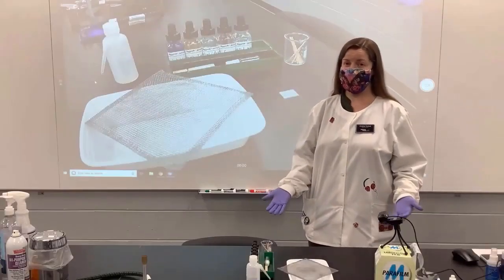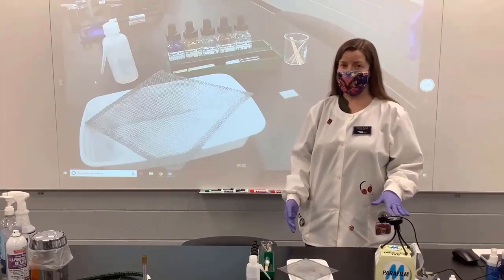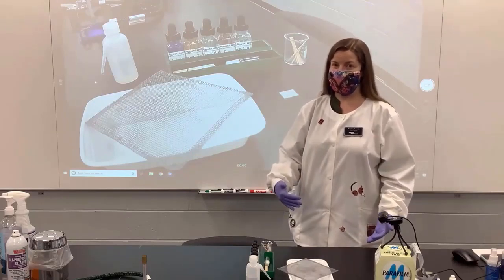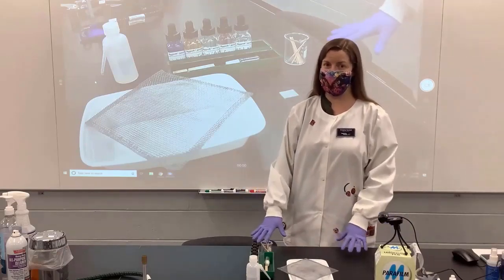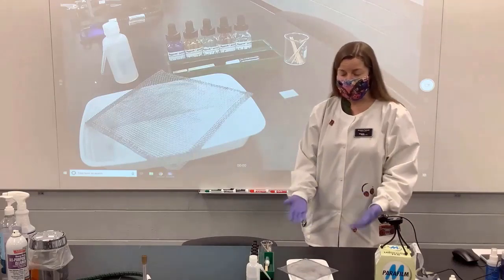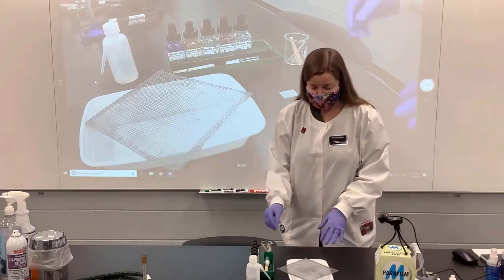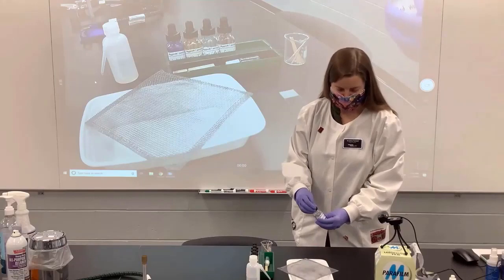All right, so this is an example of a setup I use during the in-person lab with the in-classroom webcams for a staining procedure. In the past, I would have students come up to the front desk and gather around so they could really see what was happening. This is helpful because they can still see everything that's happening up on the board, and it actually gives them a closer view than they would have gotten before. So they're not having to lean over another person's shoulder to see what's happening.